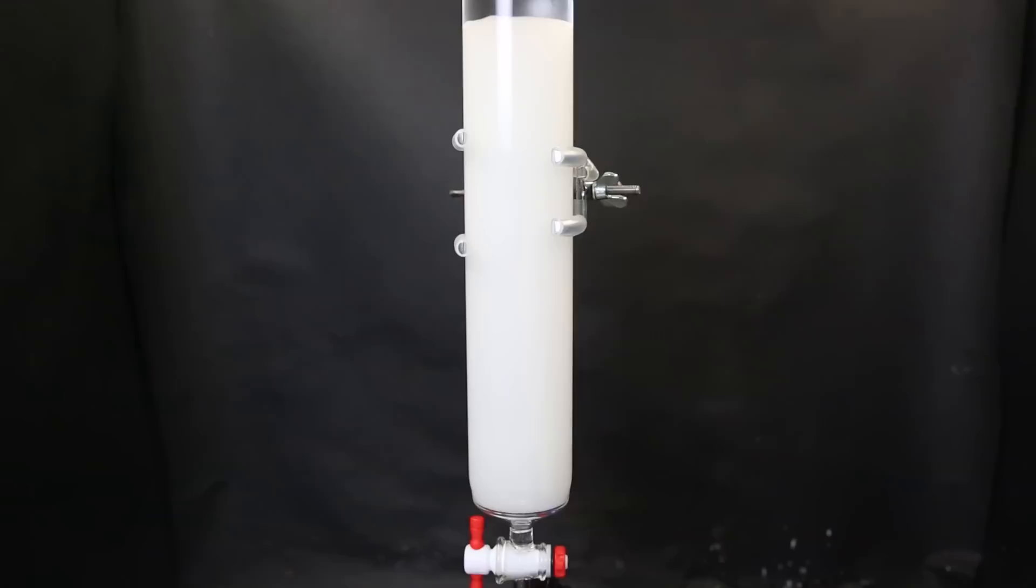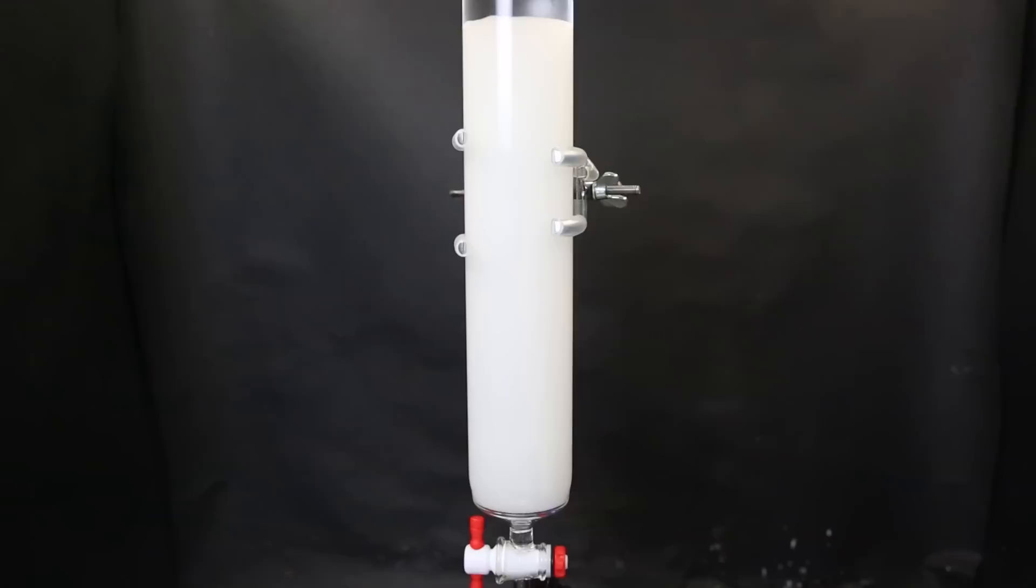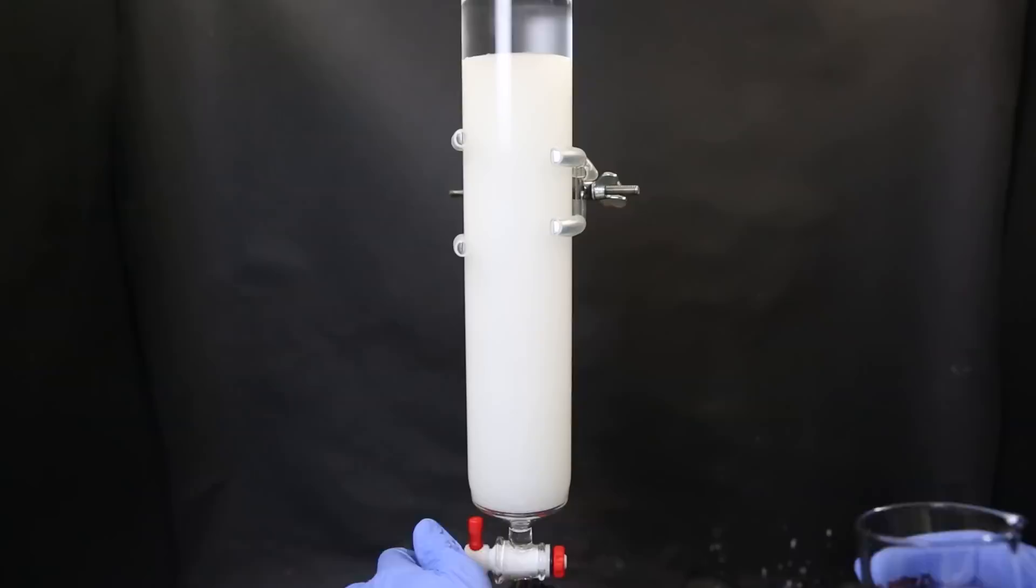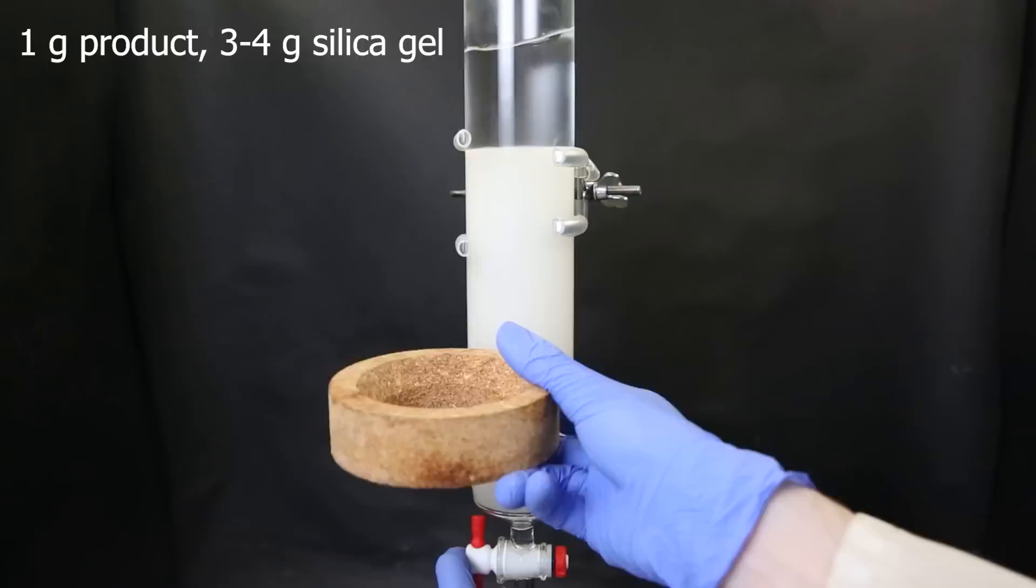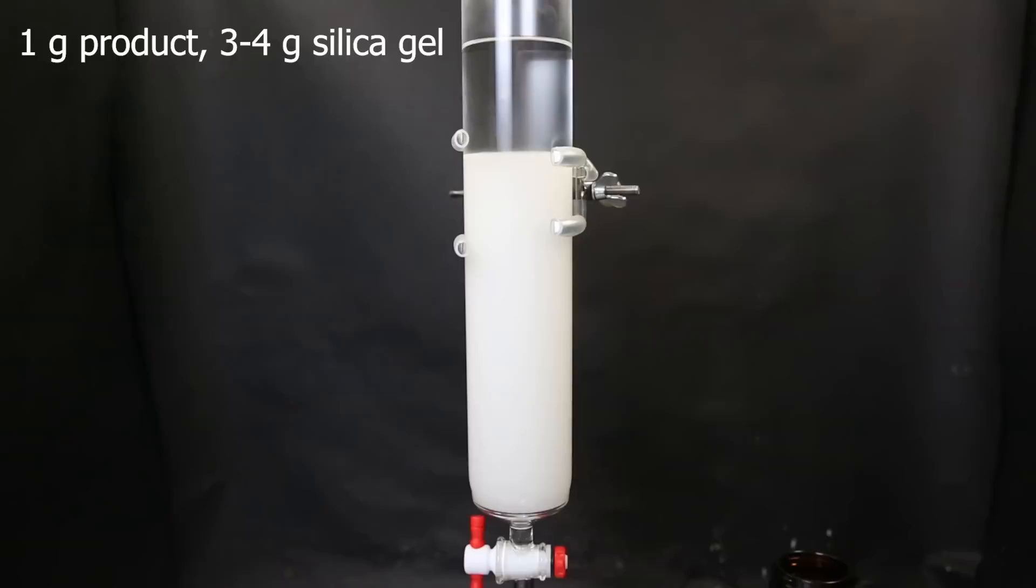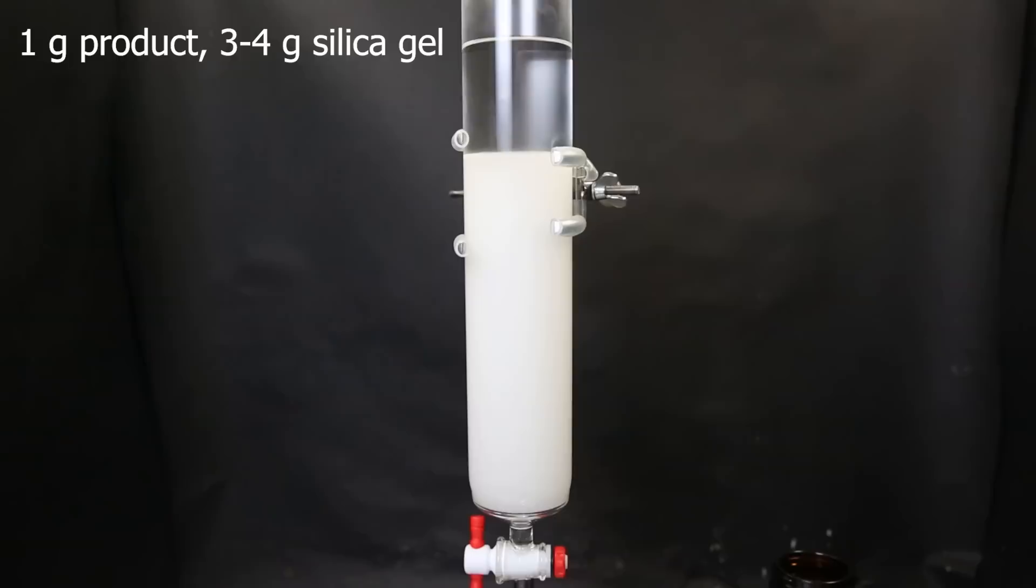So I set up a column and add in 180g of silica gel 60 in 20% DCM and 80% hexanes. Since I have a large amount of product, about 50g, I would have to use an insanely large amount of silica gel to separate them properly. Normally the ratio of silica gel to product would be 1 to 20 at lowest, but this would require an insane 1kg of silica gel to get a proper separation, and probably wouldn't even fit in the column. Now it would be a little excessive to go for a high purity final product, since that is not really necessary for what I will be doing. But at the same time, it is also a little wasteful to not process all of my product. So in this case, I will do a ratio of about 1 to 3 to 4, which will mean that there will be more overlap between the compounds when they come off the column.